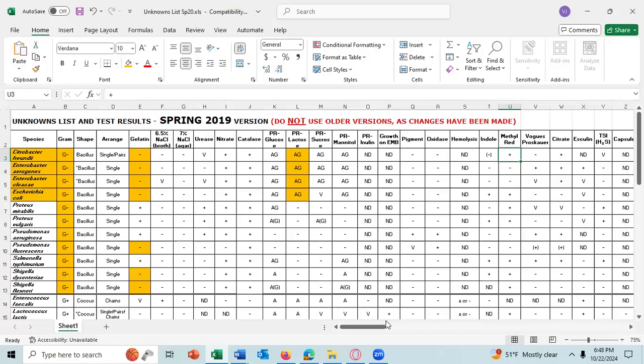I do. You said you're going to email us that? Yeah, I will email you the results to these 3 tests, the gram stain, the gelatin hydrolysis, and the PR lactose test. The reason for the gram stain is it's very simple, dividing the possibilities down in half, gram negative and gram positive.